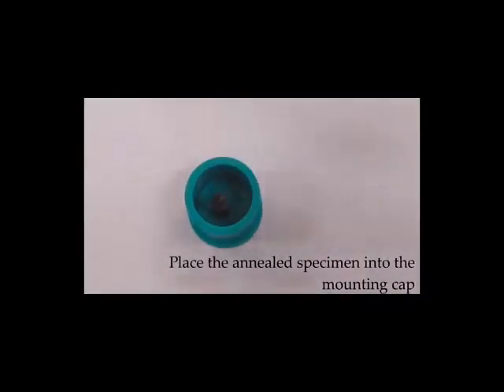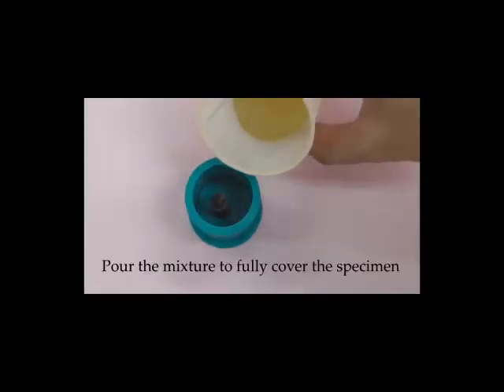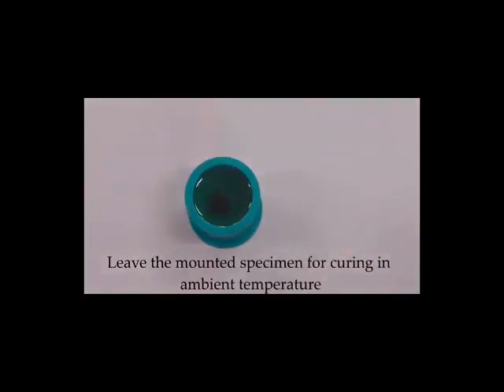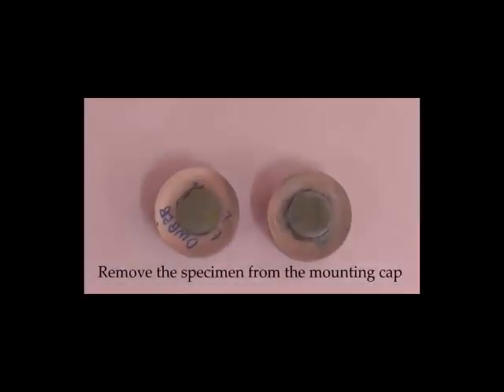Place the annealed specimen into the mounting cap. Pour the mixture to fully cover the specimen. Leave the mounted specimen for curing in ambient temperature. Remove the specimen from the mounting cap.